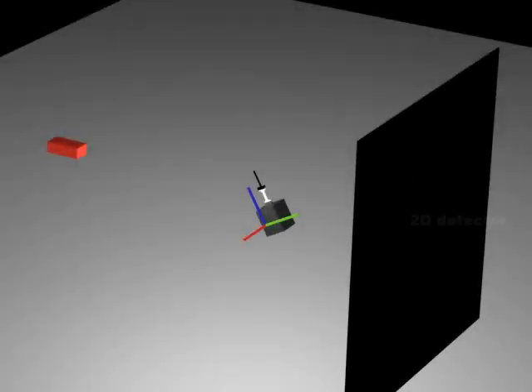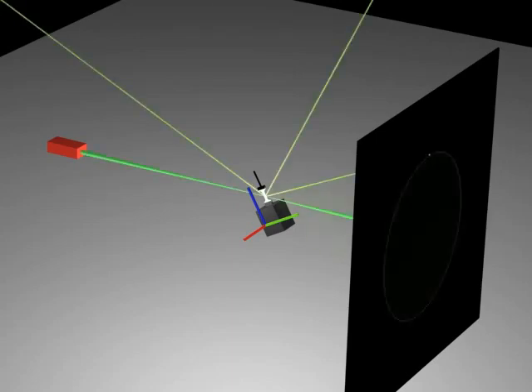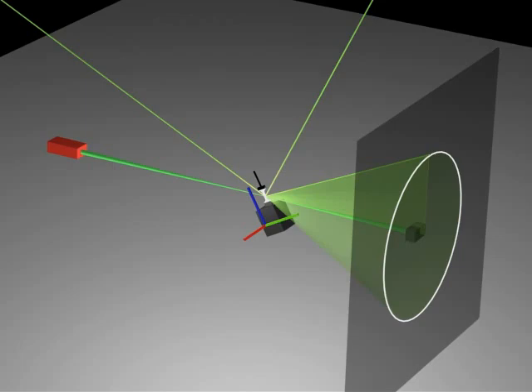Measuring pole figures with point detectors is rather costly in terms of time spent. One advantage of employing X-rays as the source is the availability of large two-dimensional detectors such as image plates or CCD arrays. With such a detector, complete Debye-Scherrer cones can be collected simultaneously, expediting the measurement of pole figures.